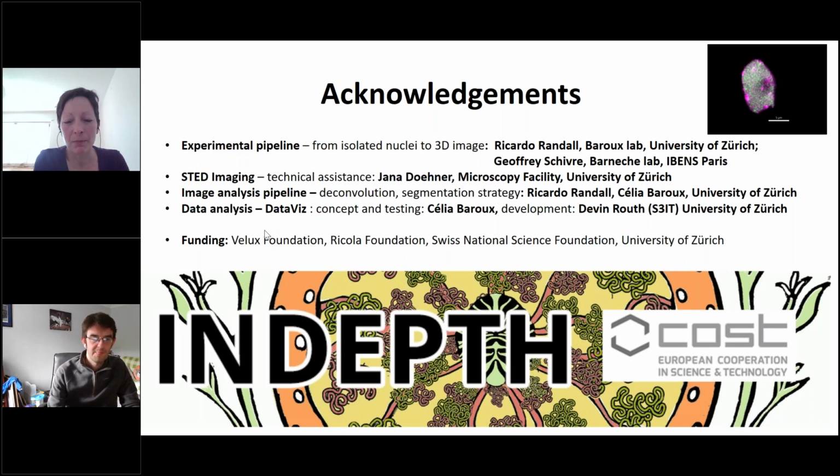Yeah, exactly. The BitPlane website has a really excellent learning resource, from basic introduction to introduction per tool per topic. It takes, of course, a little bit of time to get into it, but if you have a real research project that requires image analysis, it is worth it. And after a week, you're getting good at it.